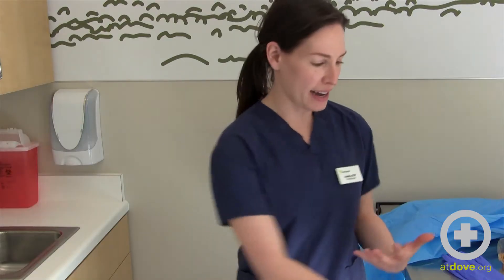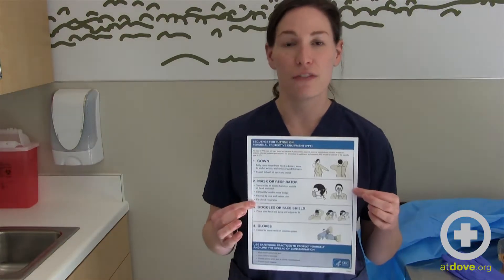Hi, I'm Jessica and I'm here today at Dove Lewis and I'm going to show you how to put on proper PPE as described here in a step-by-step guide from the CDC.